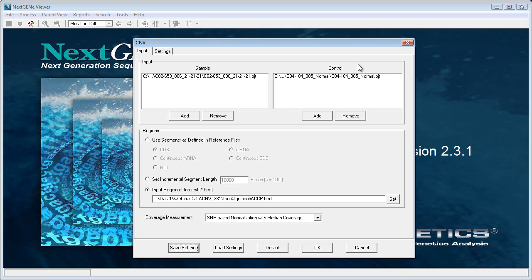After loading the sample and the control, you can select how you want to define your regions. You can do that using the built-in annotation or by looking at incremental segment length, or — and this is what we recommend — loading a BED file that lists the positions of each amplicon. That way, each amplicon is essentially a data point in this comparison.